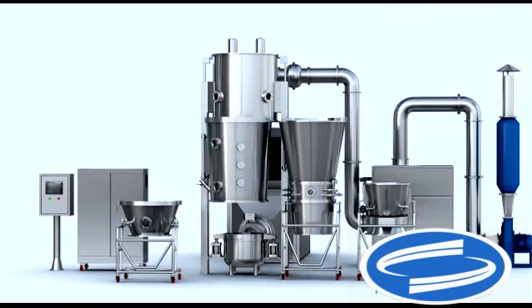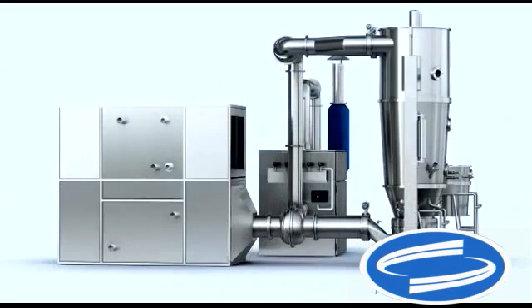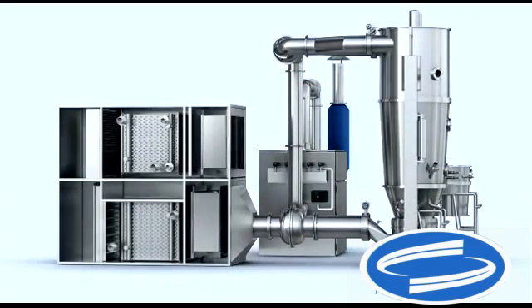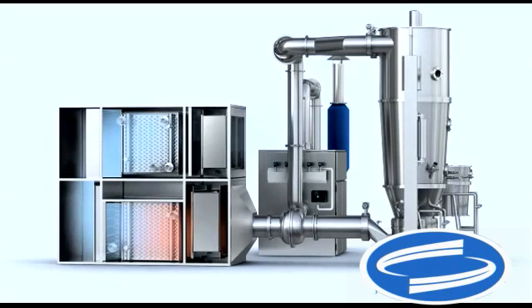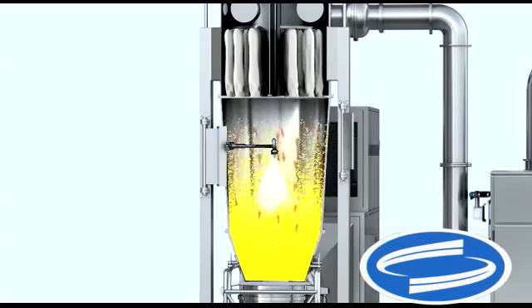The host machine system consists of the capture chamber, diffusion chamber, top spray raw material container, bottom spray raw material container, side spray raw material container, and lift base. If the top spray method is used for the granulation, the air flows into the top spray raw material container from the airflow distribution panel after filtering, dehumidification, and heating. The powder in the raw material container is fluidized and mixed.